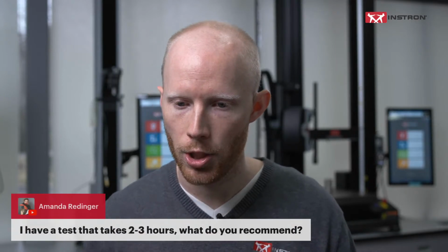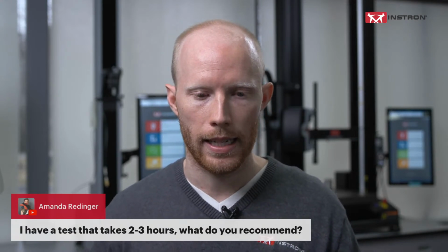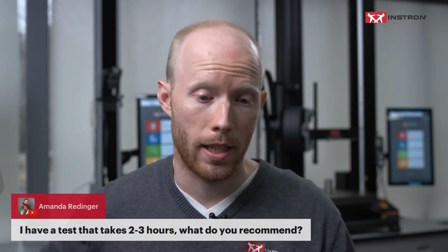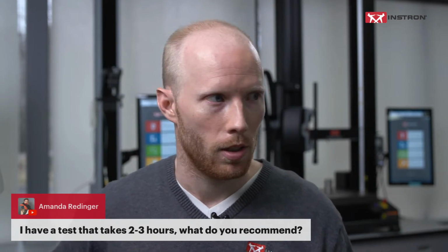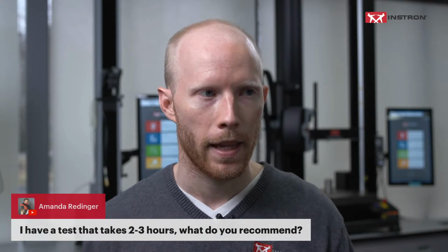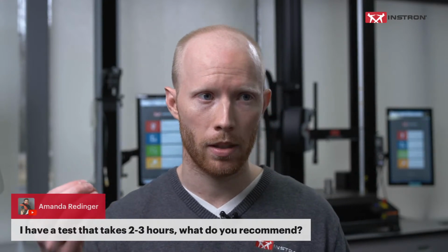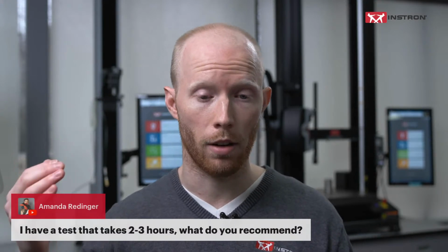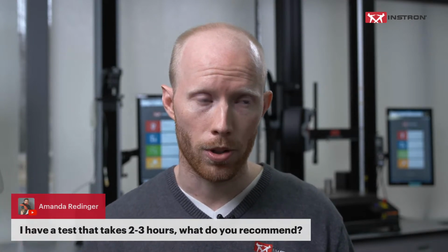And then the last question that I'd like to address today is a time-based question. If you have a very long test that takes 2 to 3 hours, what would you recommend? Again, number one recommendation, let's look at that test standard. For that length of a test, we might be holding a particular displacement for quite a bit of time and seeing how our load changes, or maybe you're holding a force and you're trying to see how displacement changes as you hold that force on your material.